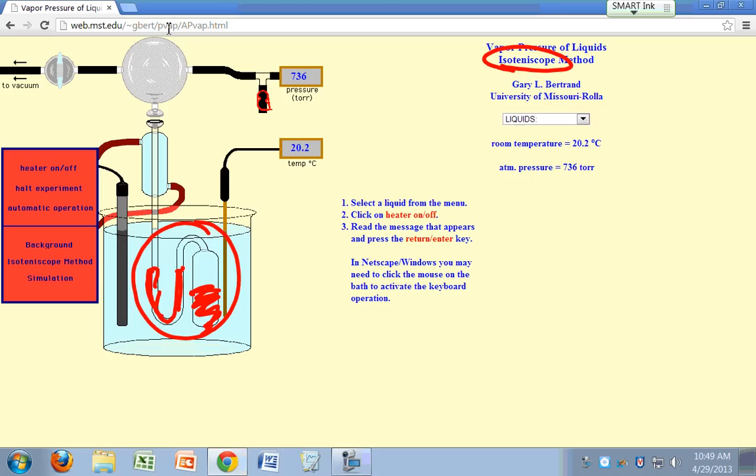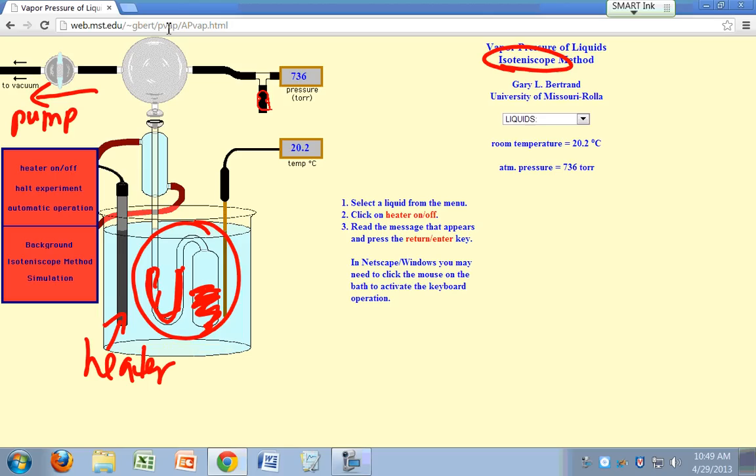And then this thing right here is a heater. Once it heats and your system is hooked up to a vacuum pump, this one pulls a vacuum. And this side right here is open to a pressure gauge so you can monitor the pressure on this side.